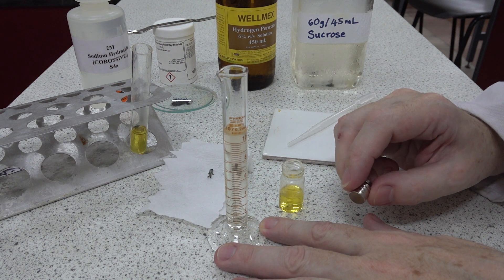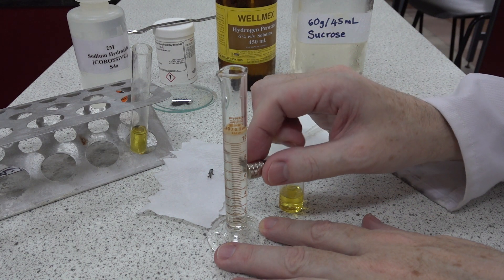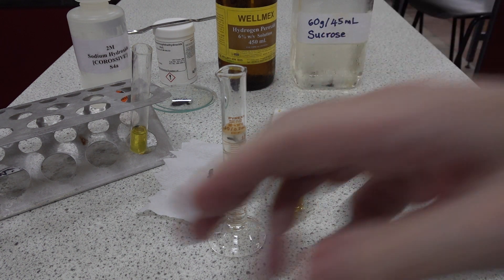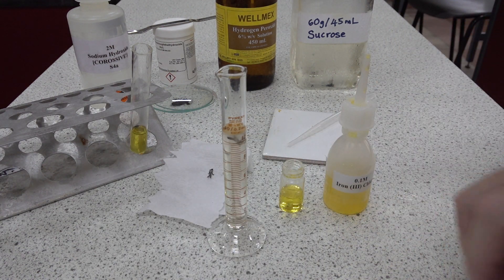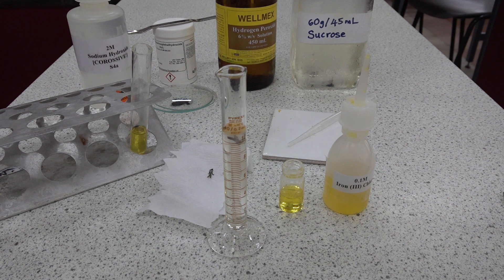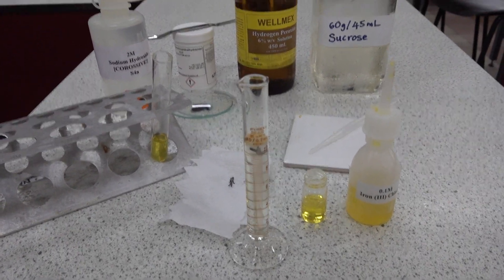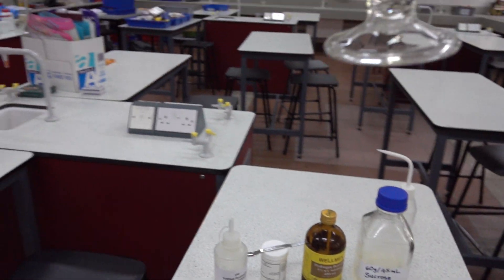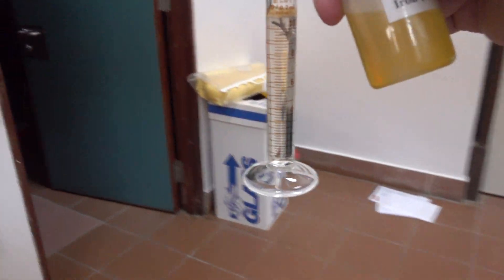We can make the diver come down to the bottom and release him again — down he goes and release. The question is what's happening if we view this in the dark. We'll now go through to the dark room, and once there have a look to see if we can see anything using the magnet. We'll also add a few drops of iron(III) chloride from the top, then transfer the diver through to the dark area.